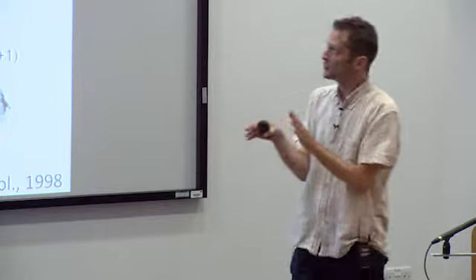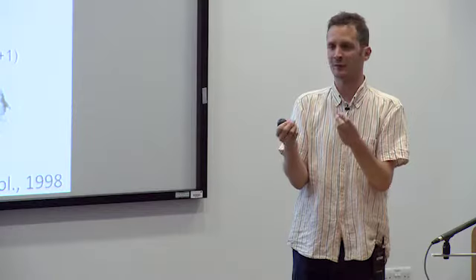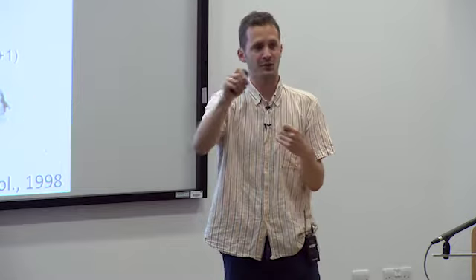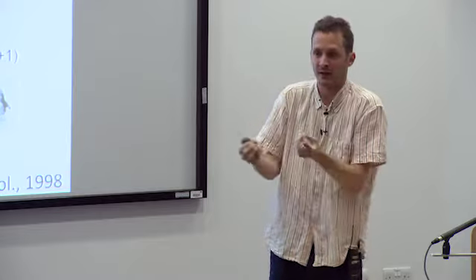And the intuitive reasoning behind it is that if you're not really sure, because there's so much noise in the images, whether the penguin is upside up or upside down, and you just put it in where the cross-correlation function is maximum, you could be making a mistake just based on the noise in the image that made it numerically slightly better in least squares or maximum cross-correlation than the actual upside up.